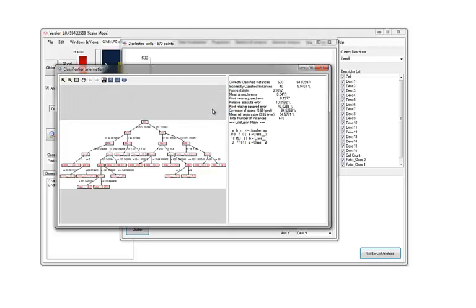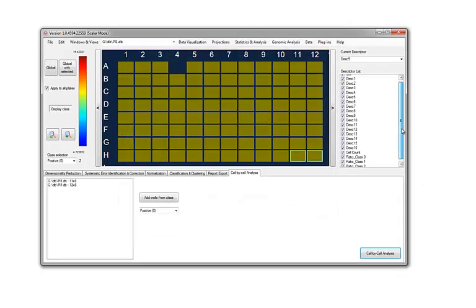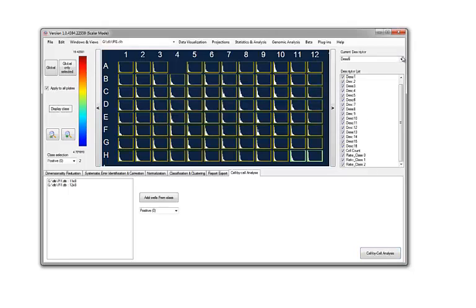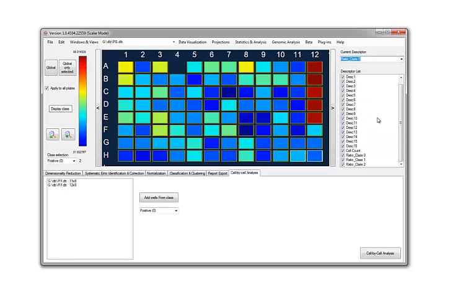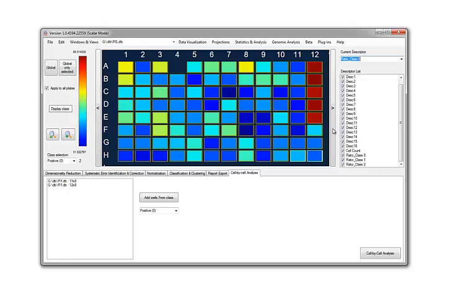So the entire screen is processed, and as you can see, we have new descriptors that are appearing. Let's close all the windows and let's take a look at the result. As you can see, we have 3 new descriptors here, and those 3 new descriptors correspond to the ratio of each cluster of each cell population. This is in percentage, so let's take a look at the value. We just move here, and as you can see, of course, the ratios are just single values. They are not histograms anymore.